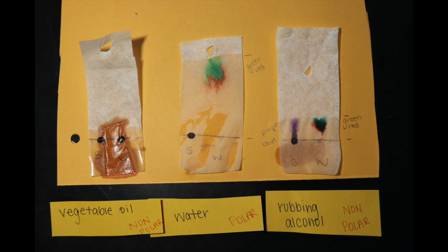Now, if we examine the water container, water is extremely polar. Therefore, it's able to move the polar washable marker, but not the Sharpie, which is nonpolar. Also, since the filter paper has very polar bonds in between the paper, you can see that the washable marker also moves up the filter paper more because it's more attracted to the paper and the water.